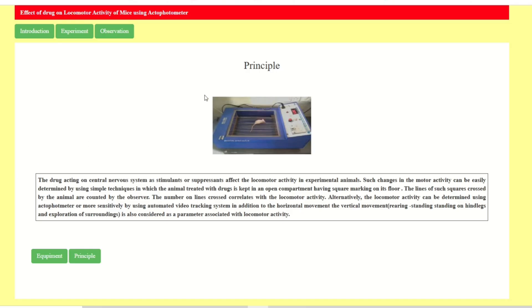Here you can see the actophotometer — the animal is placed inside and it is displaying the count of interruptions, showing the locomotor activity. The principle is: drugs acting on the central nervous system as a stimulant or depressant affect the locomotor activity in experimental animals. A stimulant increases secretion of dopamine or norepinephrine, while a depressant activates GABA receptors.